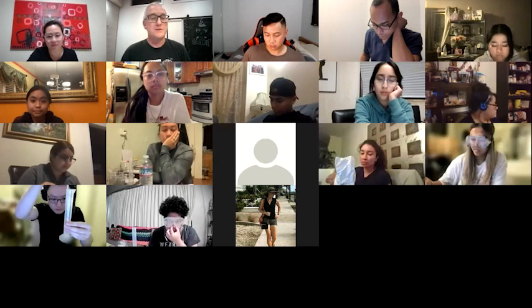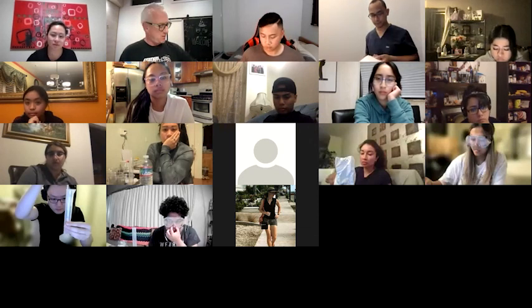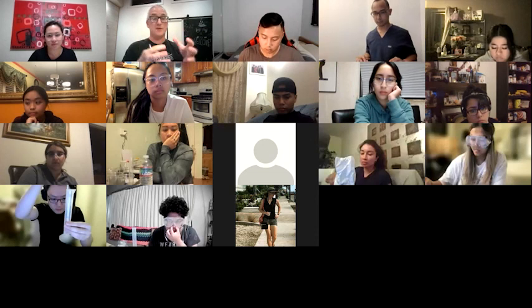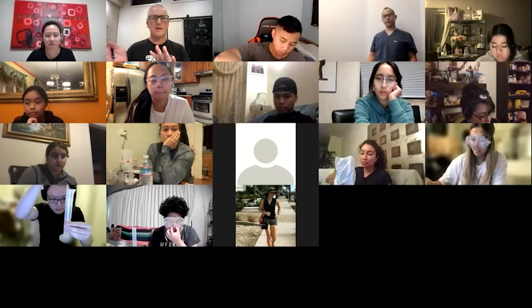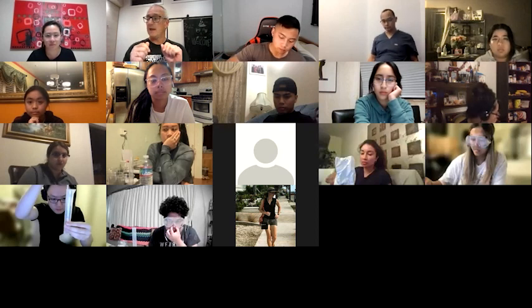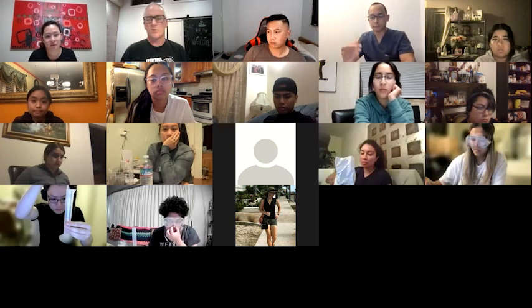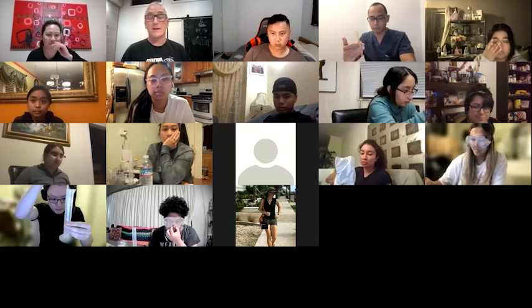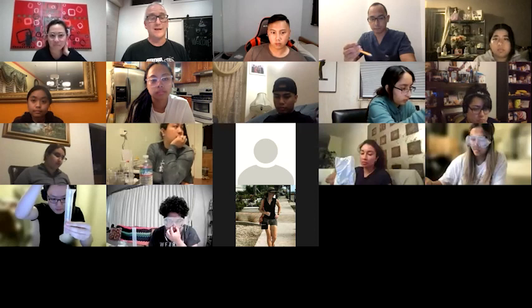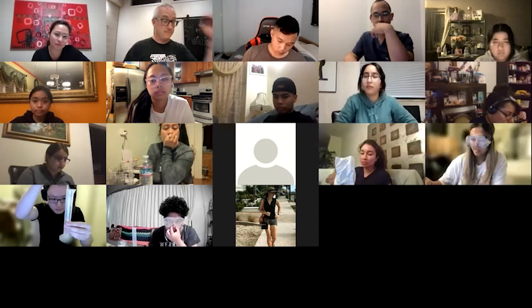So any other questions? What I would suggest is making all your solutions tonight. If you don't want to stay up super late, make your solutions, the 10 to 60%, cover them with saran wrap, put them somewhere safe, not in the fridge, and then do this tomorrow morning before you go to work or after you get home. Because tomorrow will be Friday, maybe you might want to do it on Saturday. I don't know. You don't want to leave these out for too long because, like I said, no matter how hermetically sealed you think it is, there's going to be some bacteria get in there.